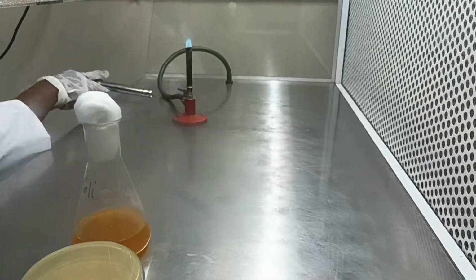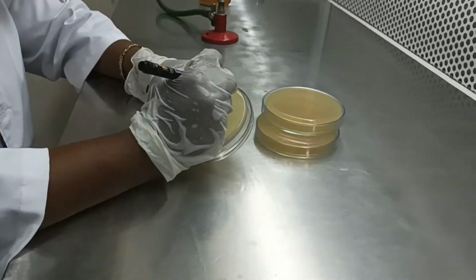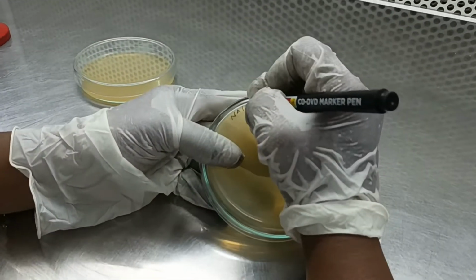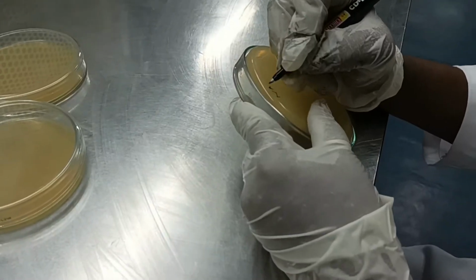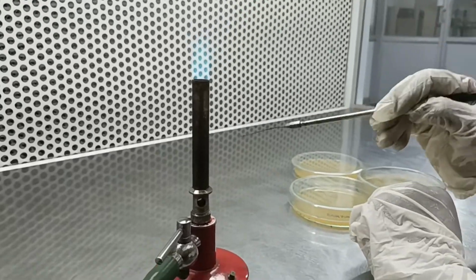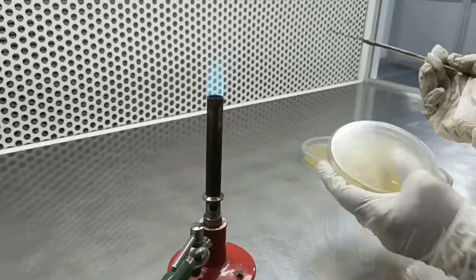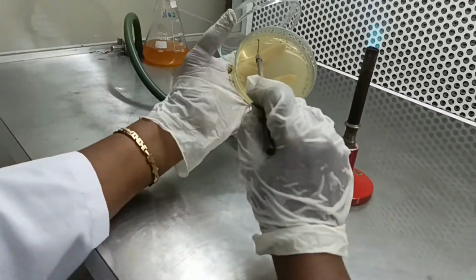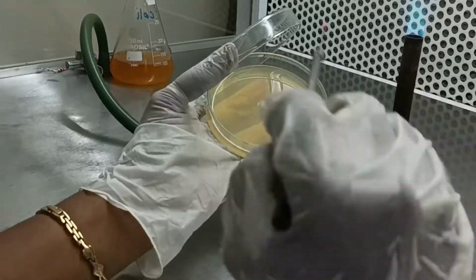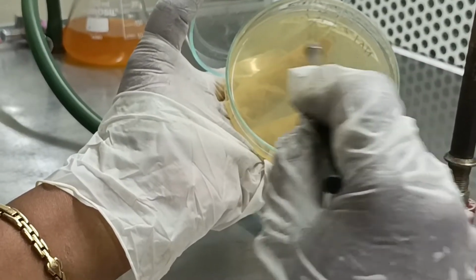Next, go for streaking. Streaking is a technique used to isolate a pure strain. The first one, quadrant streaking. Label all the plates on the bottom of the agar plates using a marker. Sterilize the loop. Withdraw 1 loopful of inoculum from the broth. Take the agar plate. Place the inoculum on the agar surface and streak the inoculum from side to side in parallel lines across the surface of the area.